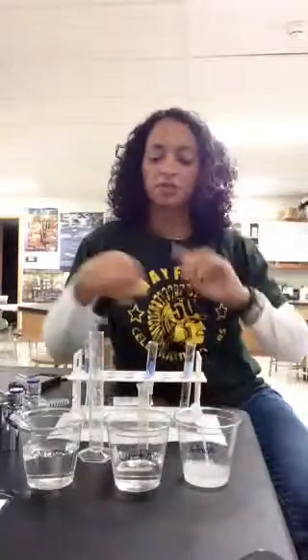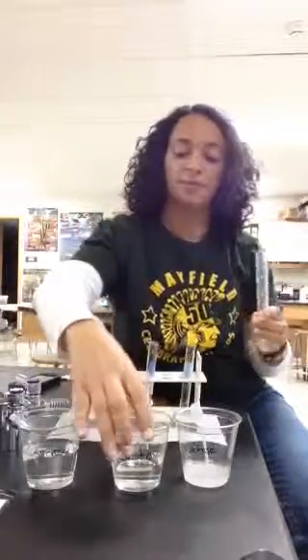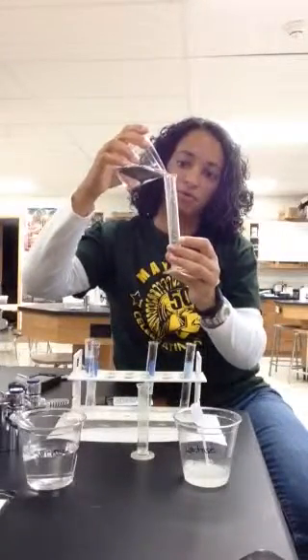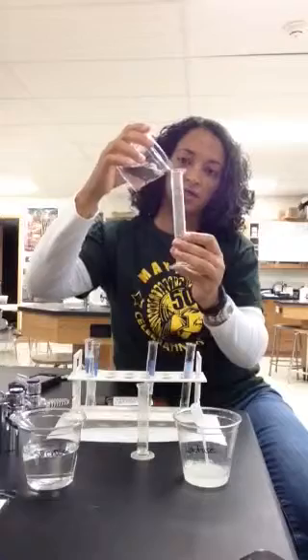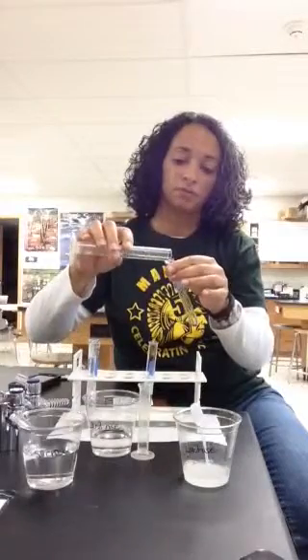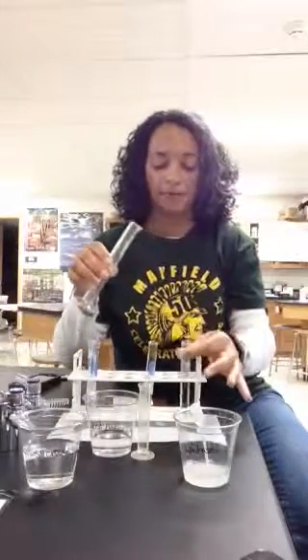So first thing I'm going to do is get my big graduated cylinder and measure out 10 milliliters of lactose. So I'm going to pour this into my little handy dandy graduated cylinder. Okay, 10 milliliters, and I'm going to pour it in one of my test tubes. Fill this test tube up. Put that back in the holder.